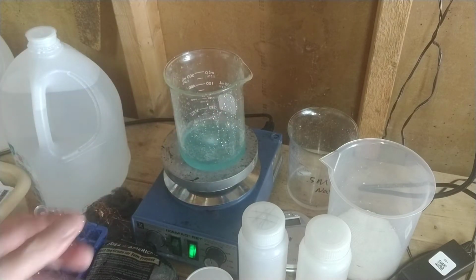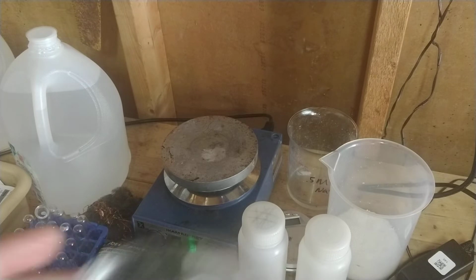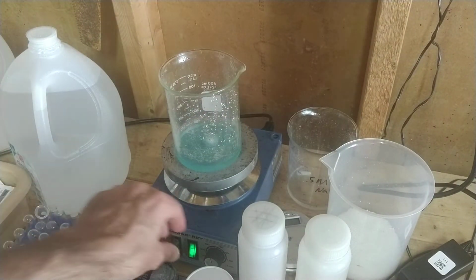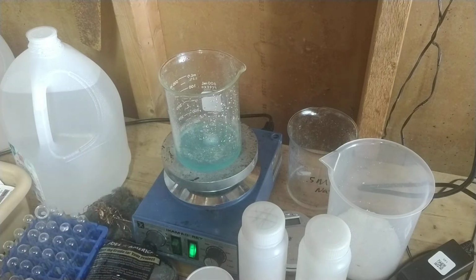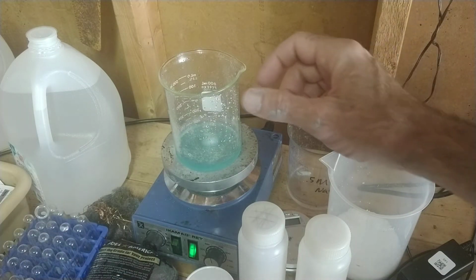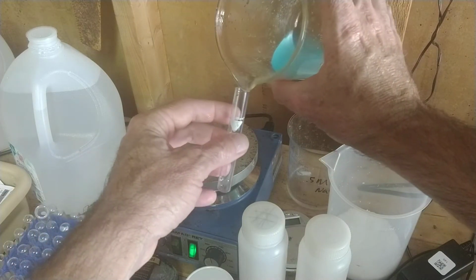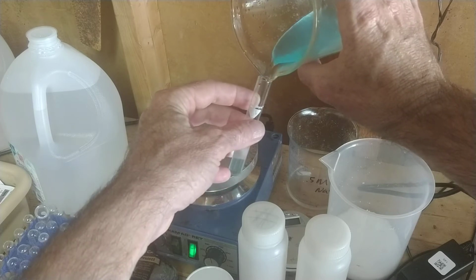All right, so I've got just about all of this dissolved. You should see, it's just a blue liquid now. I don't see any powder left in there. So we just proved that copper 2 sulfate is soluble. I'm going to take some of this copper 2 sulfate and I'm going to put it in a little test tube. Why would I do that? I'm going to do that so we can do a chemical experiment with it.